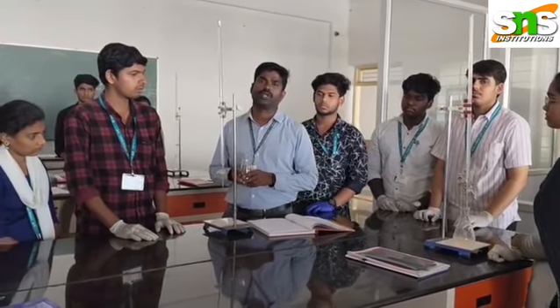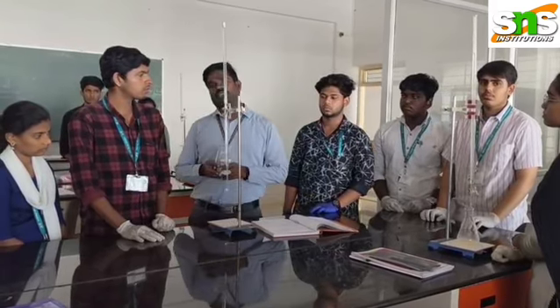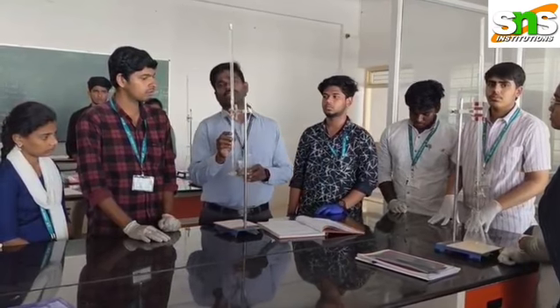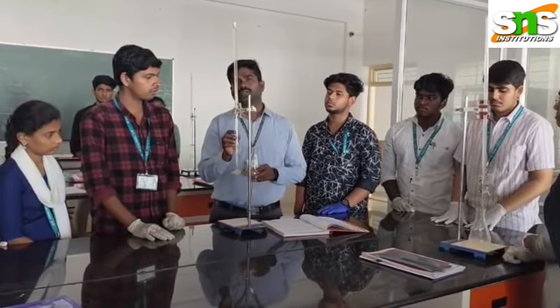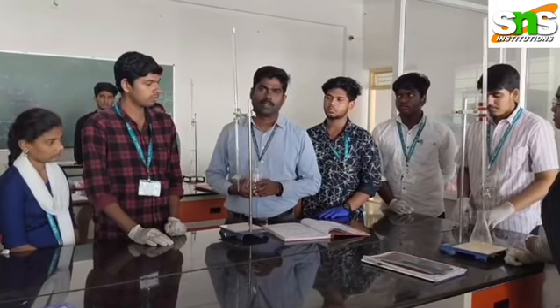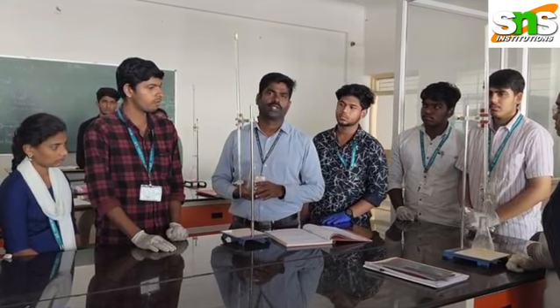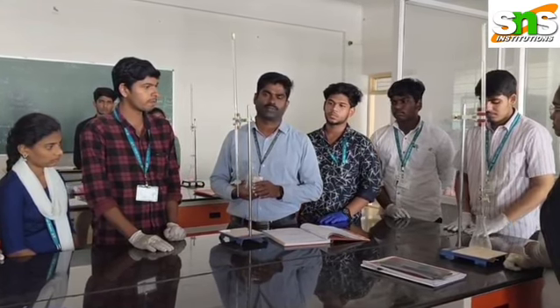Finally we are going to end with the end point. After getting the end point, we can find out the titrant volume. Then we can find out the normality of the prepared sulfuric acid today.